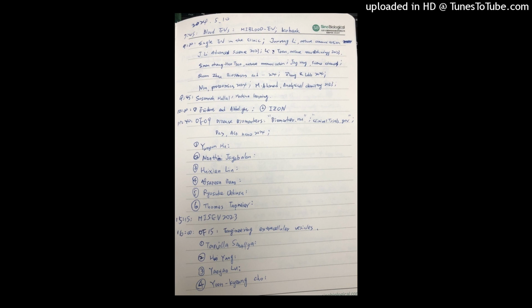And the smokers' FTIR protein spectra were quite similar to those of the oral cancer cases, and the FTIR transmittance intensity ratio of the amino acids also distinguished the smokers from the non-smokers. And it is required to validate the data with a large population set.